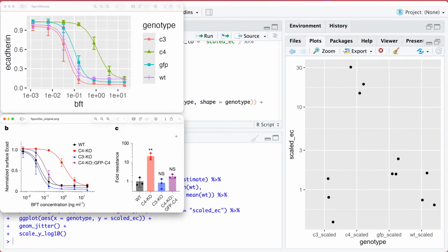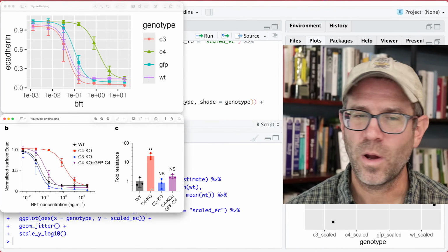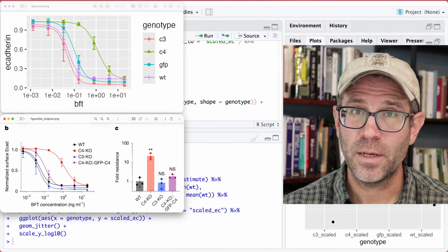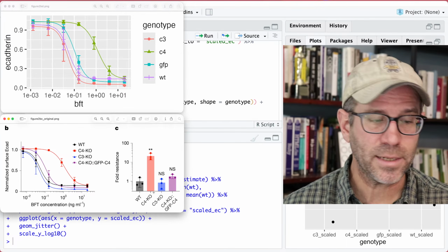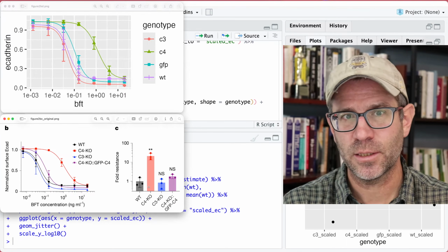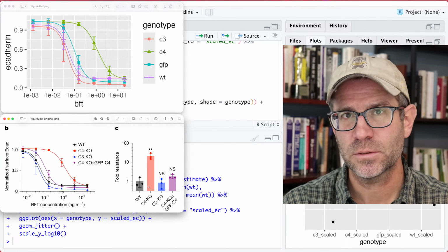One thing I do want to point out is that I, in my critique videos, have been on about why we should not be putting bar plots on a log scale. A bar plot needs to have 0 on the y-axis, because what humans do when we look at something like this is we're comparing the heights of those bars.